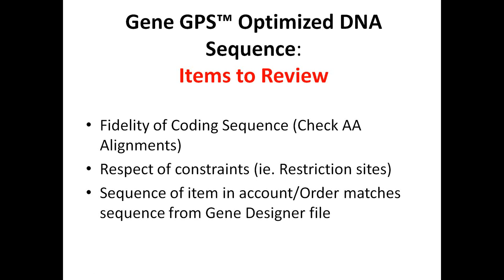First is, is the amino acid sequence that I requested intact? Has DNA 2.0 respected my constraints? And generally those are restriction sites. And finally, is the sequence that's in my online account identical to the sequence in the gene designer file that I'm actually reviewing?